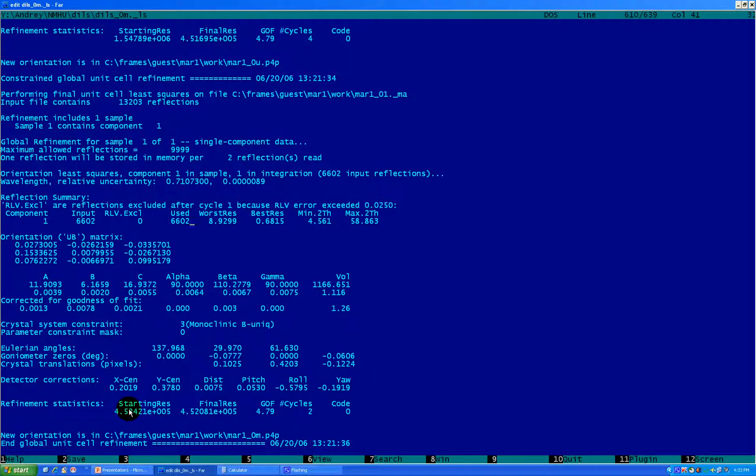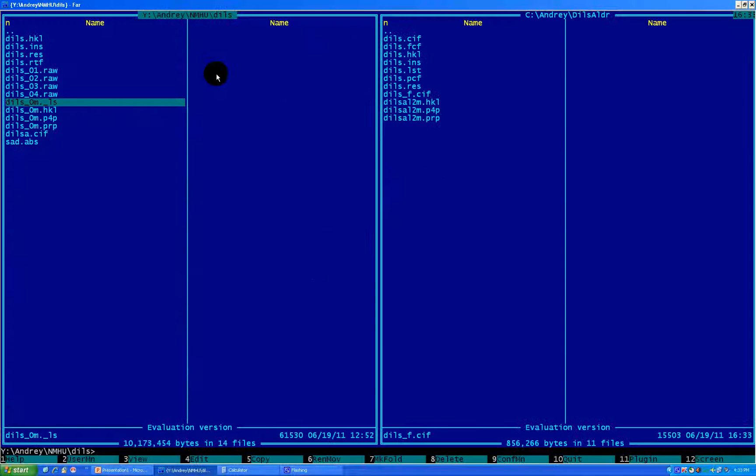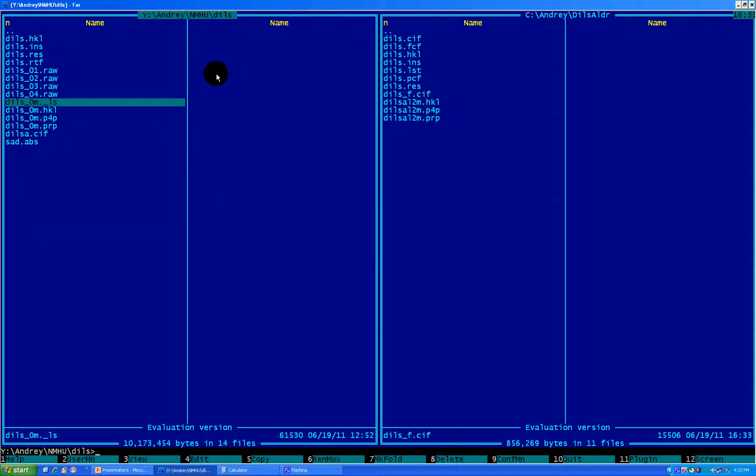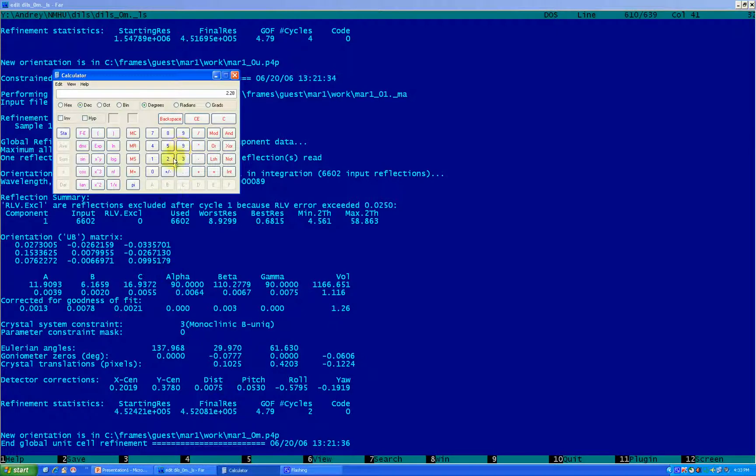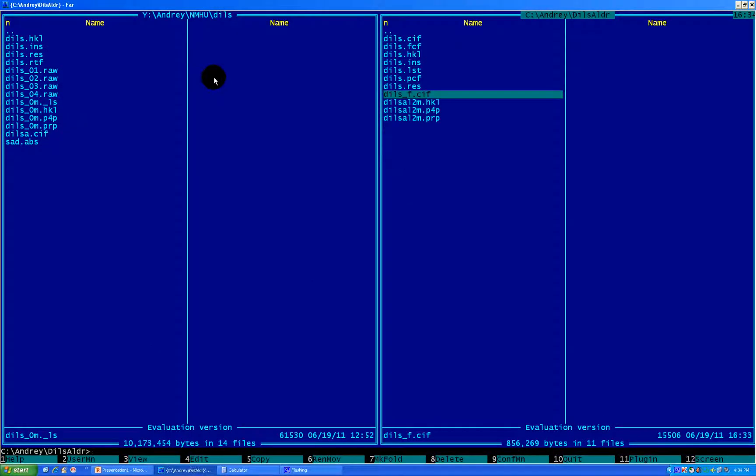Then we have a minimum 2-theta and we want to transfer it to theta. So it's 4.56 divided by 2, 2.28. So that's what I'm putting here. 2.28. And maximum was 58.86. So 58.86 divided by 2 would be 29.43. 29.43, that's what I'm introducing here. So we filled up this information.